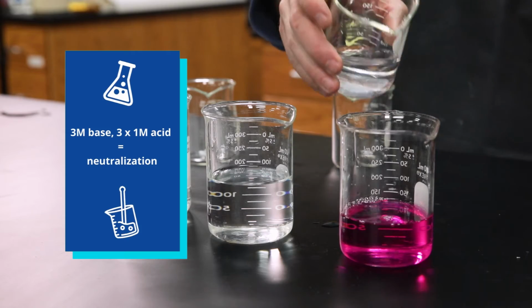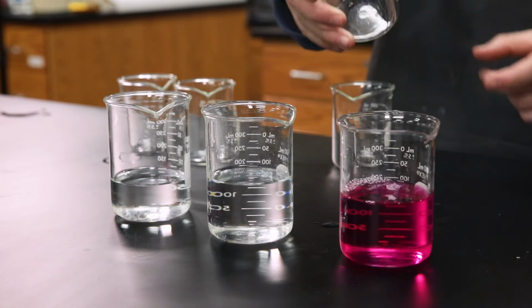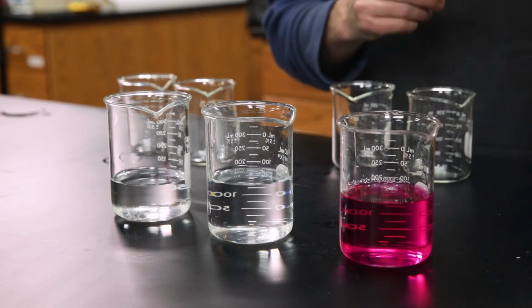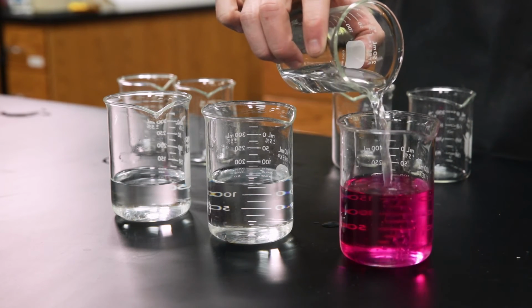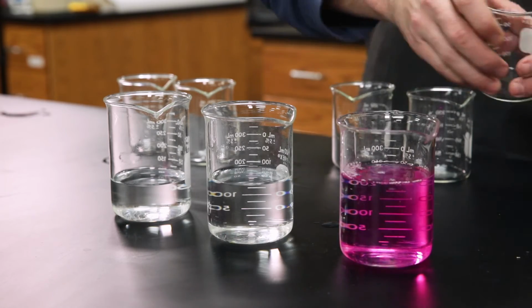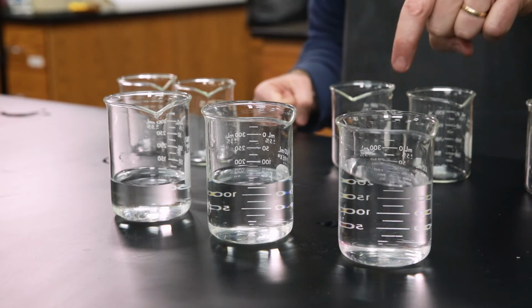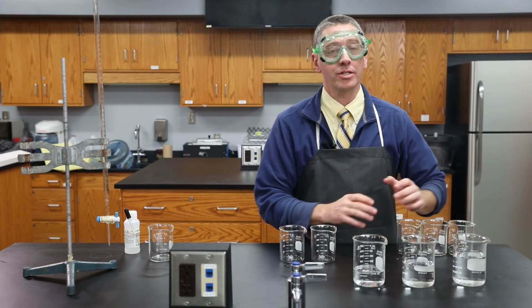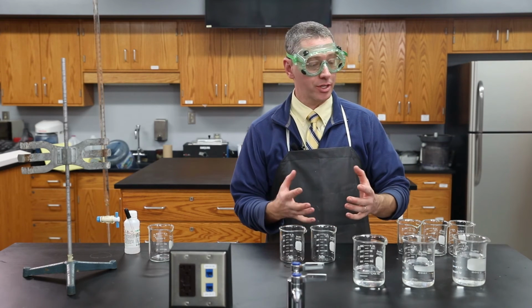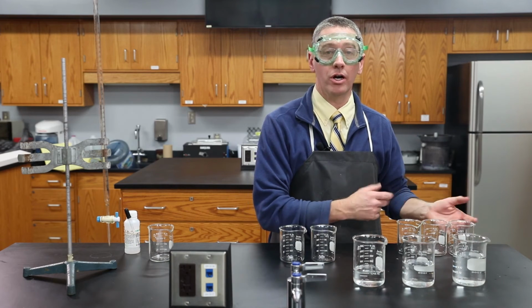Here comes the second acid. So now we have twice as many H's as we had. Still not neutral. But when we add the third one, we reach the neutralization point because now we have the same amount of OH minus as H plus. So this is a general idea of titration, using a concentration that you know to determine the concentration of an unknown chemical.